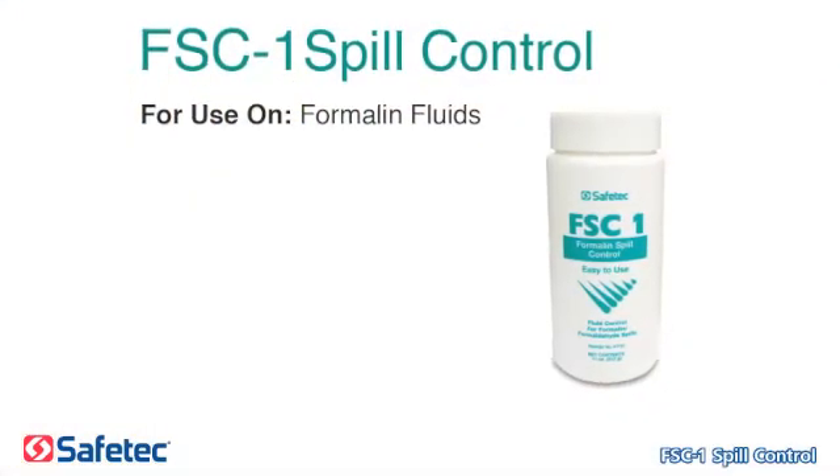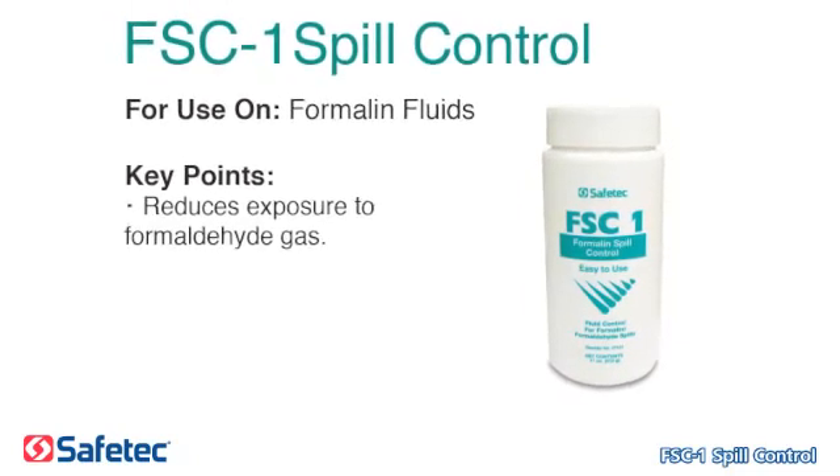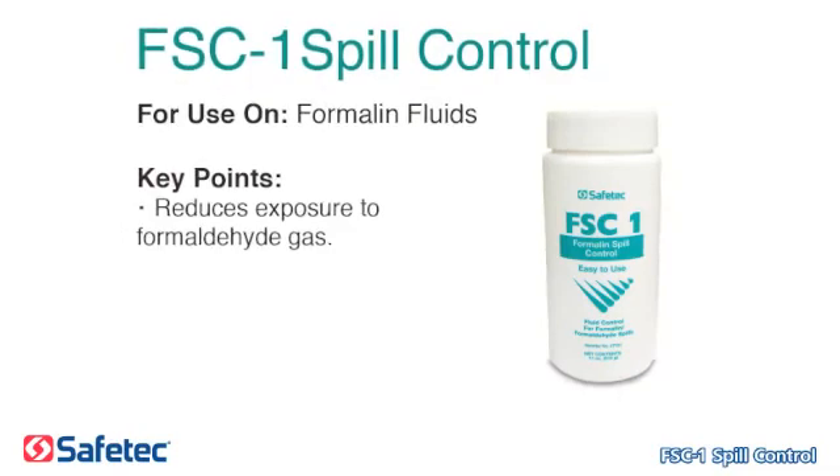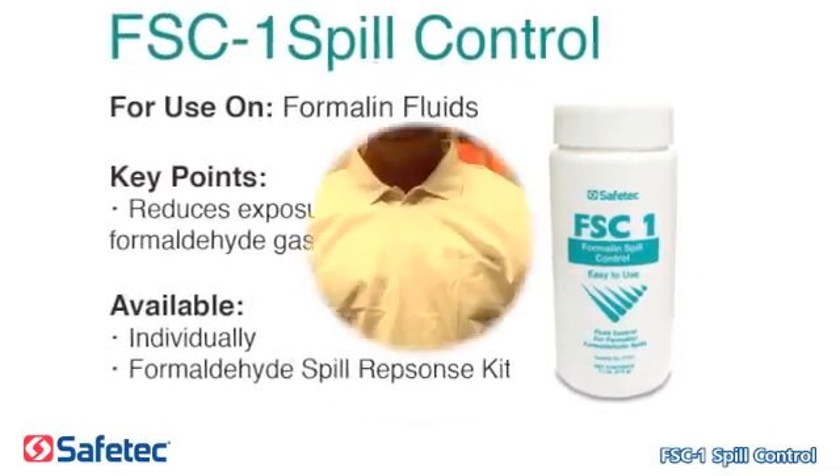Safetec's FSC-1 Spill Control is for use on formalin fluids. Key points to remember: it reduces exposure to formaldehyde gas. It is available individually and in the formaldehyde spill response kit.